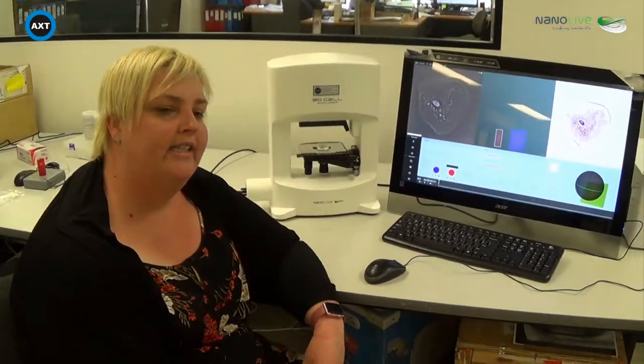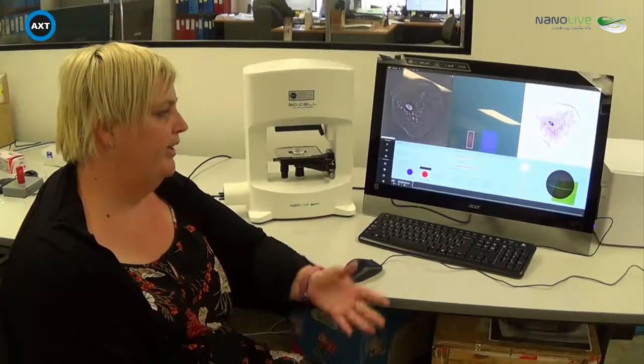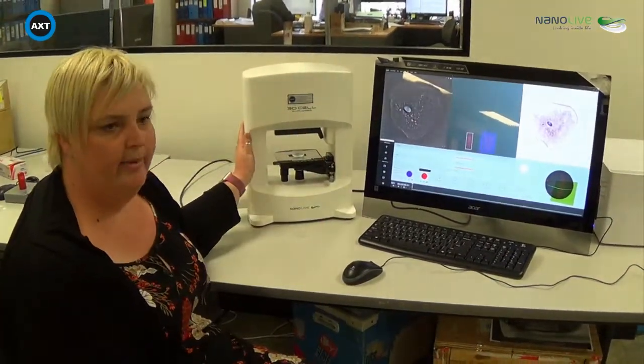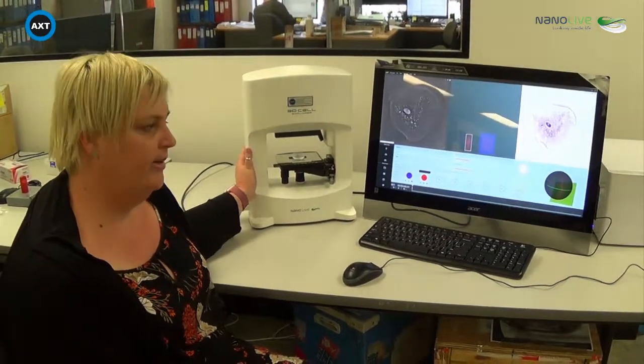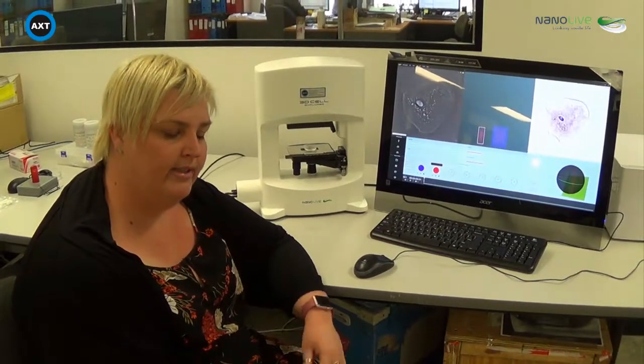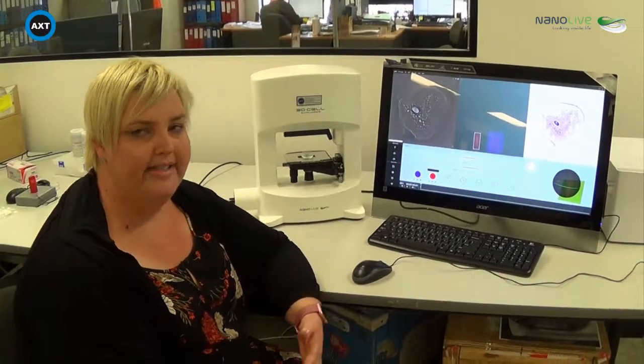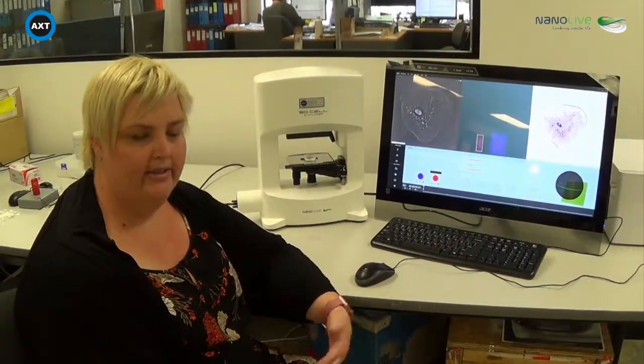And so how does that relate to the 4D imaging capability? Okay, so for 4D imaging you can capture images overnight. We can put the microscope inside of an incubator that controls CO2, humidity and temperature, and you're able to capture variable numbers of frames throughout the process. So you could do a 10-hour incubation where you're capturing images every 10 minutes, and then you can track some event over time.